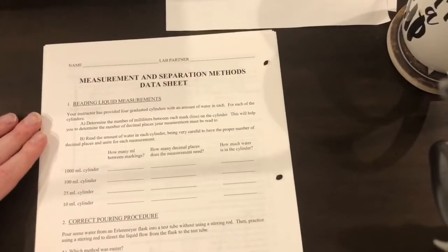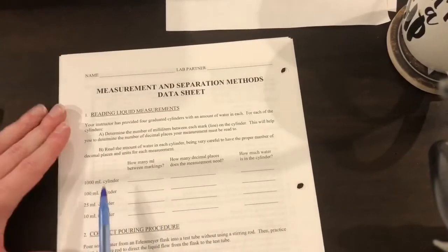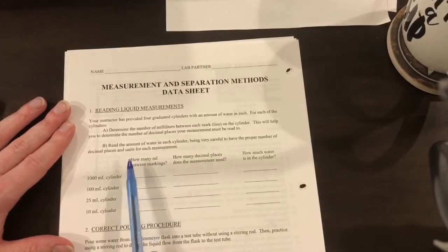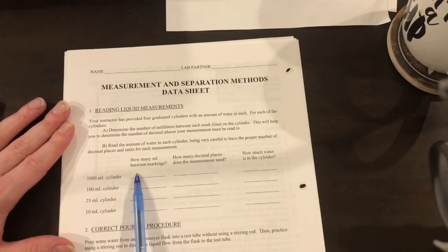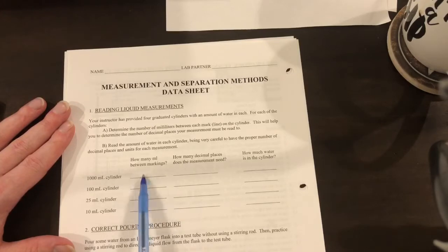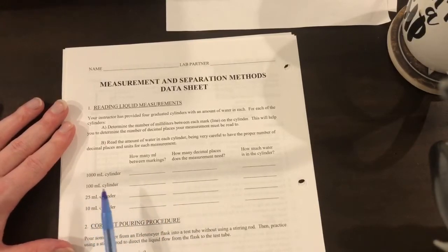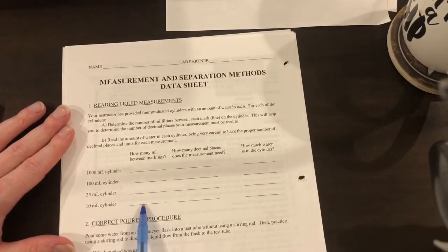This is how we fill out the data table for the reading liquid measurements portion of the lab. We have our 1,000 mL, 100 mL, 25 mL, and 10 mL cylinders. The 1,000 mL goes by every 100, with little markings by 10 mL. The 100 mL has each tick at 1 mL. The 25 mL markings are half a milliliter apart, and the 10 mL goes by tenths.